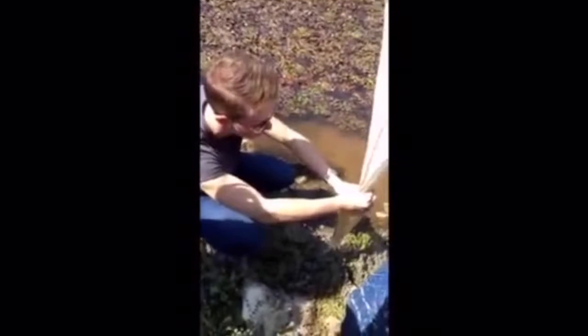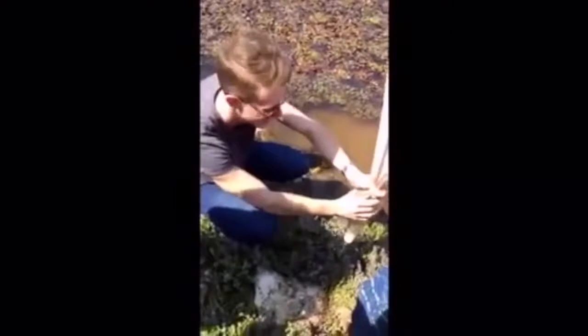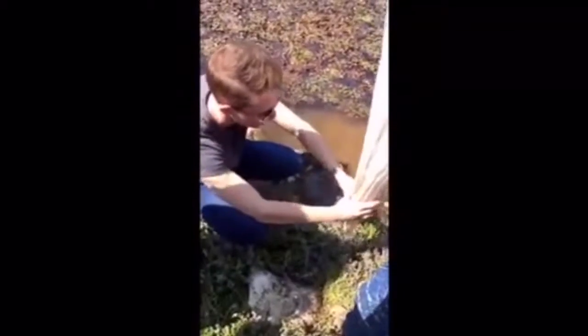Why would we sample plankton organisms from some water body? To see the density of the population of the ecosystem. And so we took some water from the lake, 10 liters, to put it inside the plankton net, so it can filter the water, so we can collect the organisms that are living in the lake. We took 3 samples of the organisms. We put them in falcon tubes with 5 to 10 milliliters of alcohol, and then we put the dates and the place of collect, so we can analyze it tonight.